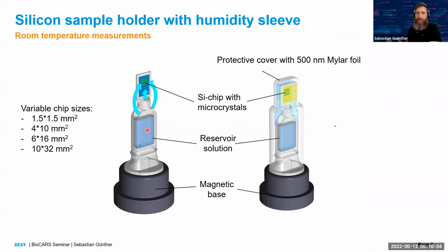So basically, the buffer composition in which your crystals would be. And then we have a cover which we can slide over. There's an O-ring here which seals this airtight, and we have Mylar windows here. So now we have evaporation, and the atmosphere around the crystals will reach the same level as the crystals had in the crystal slurry, so that prevents them from further drying out.